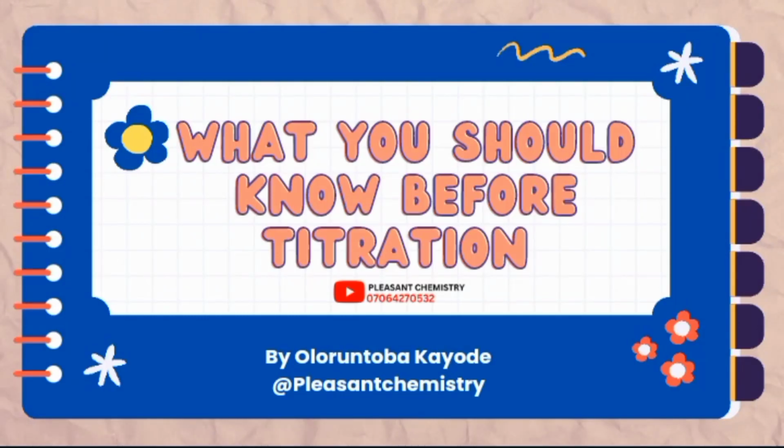In today's video, I'll be showing us how you can avoid errors while you are taking your readings on Burette. I mean, when you are creating tables of values which will generate your TITRE value. This is what I'll be discussing in this video today: the errors students commit while forming their tables of value, the penalty for those errors, and how you can also correct those errors in your subsequent examination.